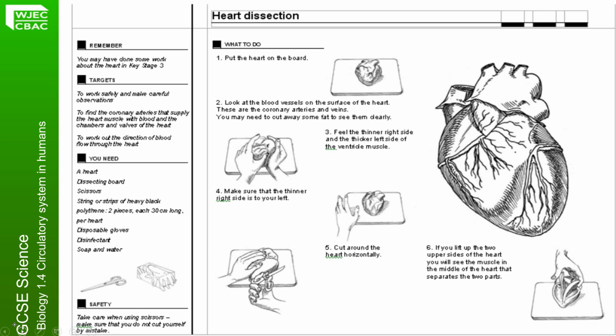So what would you need to dissect a heart? Well, obviously a heart, a dissecting board it says here, however a wooden board, a chopping board is fine. They're better than glass chopping tiles that you might have at home in the house because there's a little bit more friction and your heart isn't going to go slipping across the surface. So please be careful. Some either dissecting scissors or sharp scissors at home. I'm afraid the plastic children's variety will not cut this.